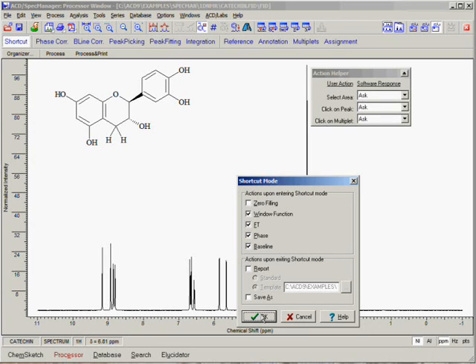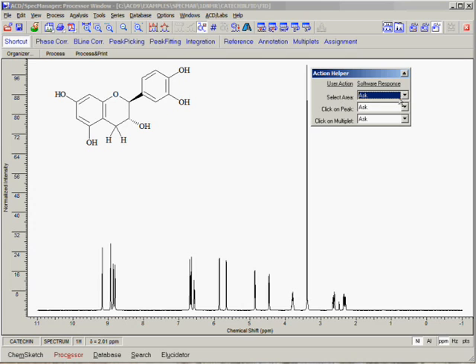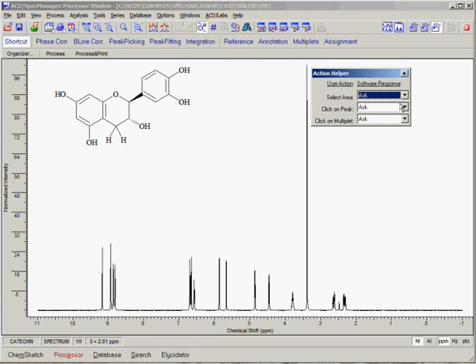Once we are in Shortcut Mode, the Action Helper appears. This window is used to determine which operation will be performed on the spectrum when a specific action with the mouse is completed. As you can see, all procedures are currently set to Ask. This means that whenever one of these mouse movements is completed, the software will ask us which action we would like to perform.